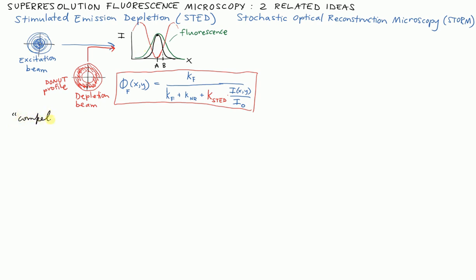That we are compelling excited molecules that are away from the center, away from a chosen special spatial location, we're telling those molecules to choose a non-fluorescent decay.